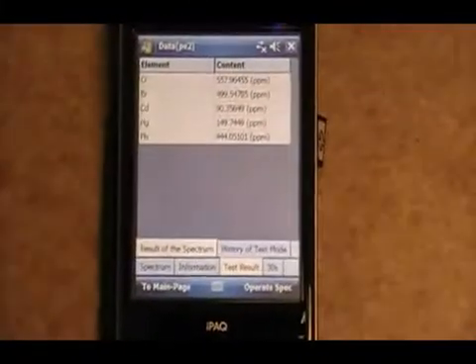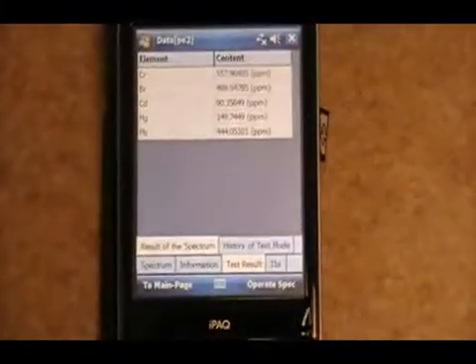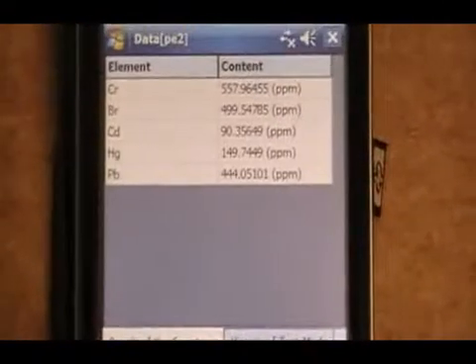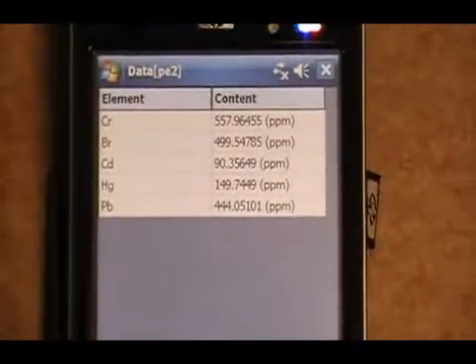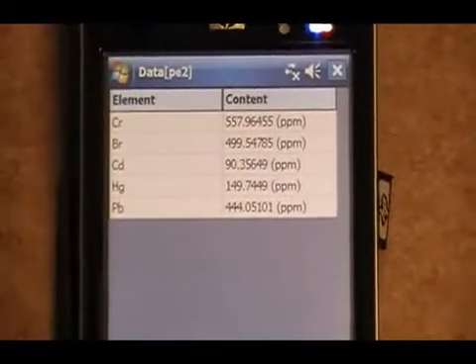In this case, my chrome is already reading approximately 500. My bromine is at 500.